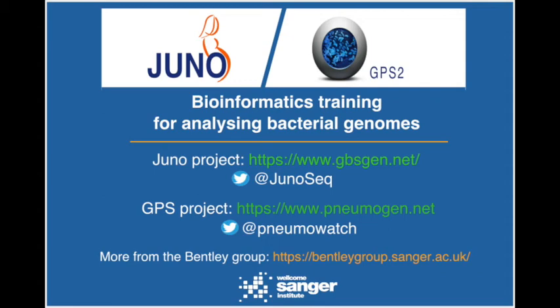When we chose the lineage-specific sequences for different GPSCs in Pneumo, as I said, we chose the ancient one because it helps us do the Bayesian analysis to construct the time-measured tree. Those references are all published in the recent Microbial Genomics paper, and I can share the resources here so everyone can download the reference genomes and do the analysis.